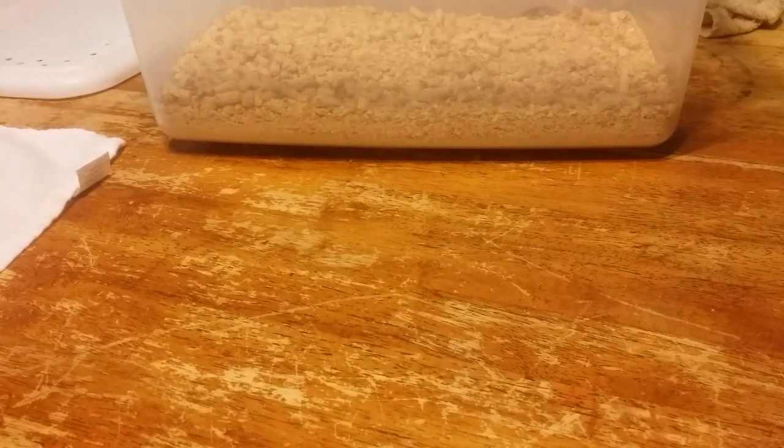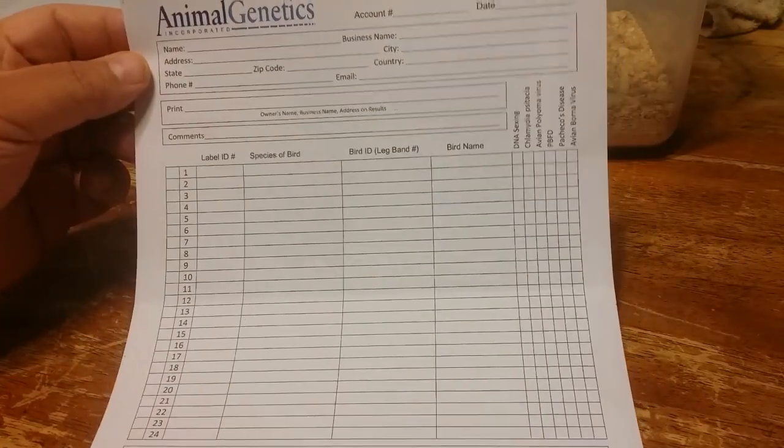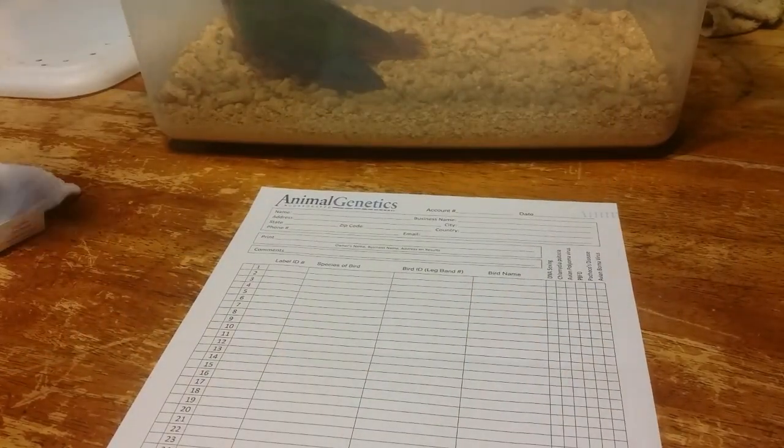You're going to get on your computer, go online, and choose the DNA laboratory that you want to use. I use Asian Biotech, also known as Animal Genetics. It's a laboratory in Florida and I've always had really good success with them. There are others that are less expensive, but I have found that like in all things in life you get what you pay for. So I recommend Animal Genetics, and you're going to order blood cards.